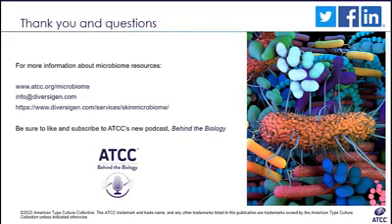And what's another Diversigen question? What's the lower limit of detection of Diversigen's low biomass pipeline for the microbiome samples? Yeah, that's a great question. In terms of the 16S copy number, it really depends on the site, and I think I showed that very briefly, but it's around 10,000 copies.